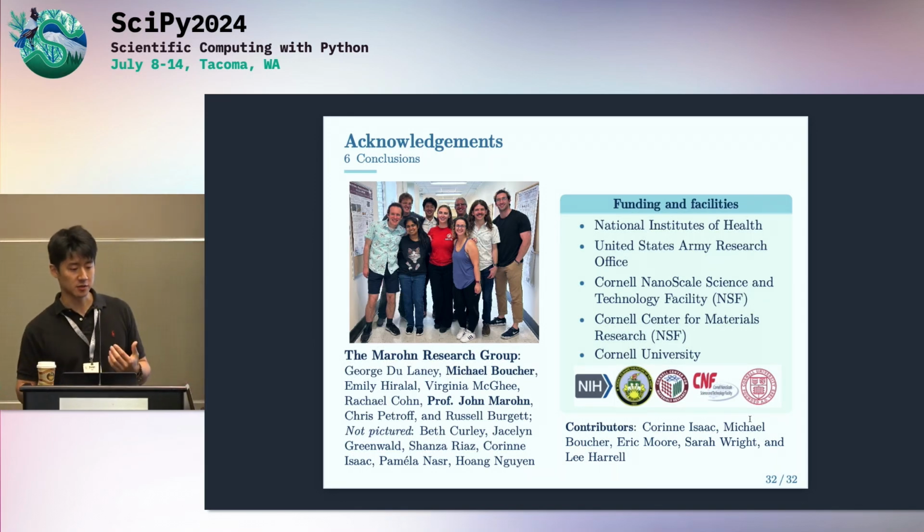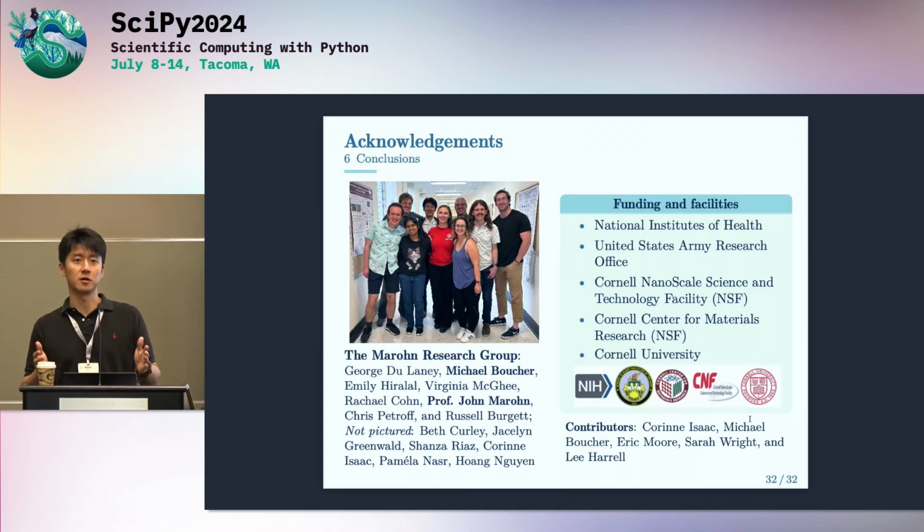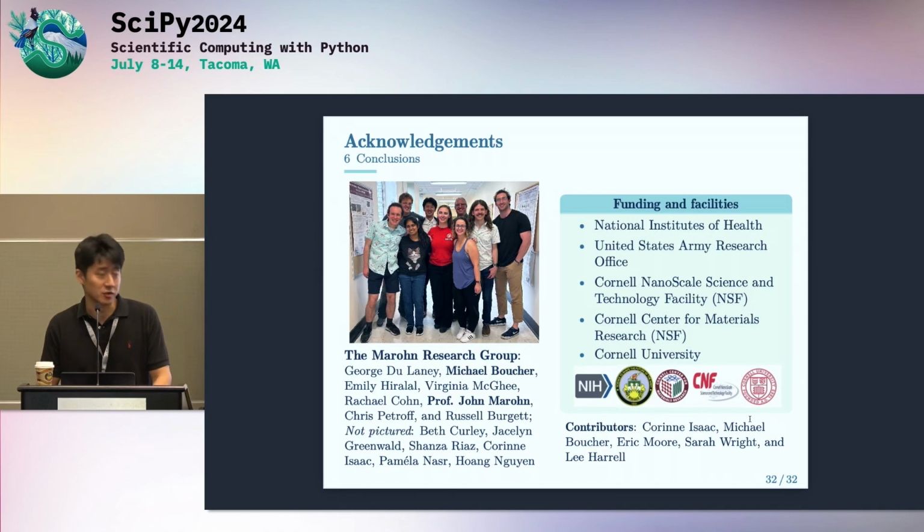Yeah, so these simulations are really dependent on the grid size because we're doing 3D simulation, right? We're doing 3D images. If you think about angstrom resolution in the future, you really want a really small grid size. And so the simulation cost will go up dramatically. That can't be handled by our own computers. So right now, about 1 million data points on a computer costs about a minute to run. If you scale that up, it really will hurt in the future when we get to that resolution in the experiment. So I think that's sort of down the line.